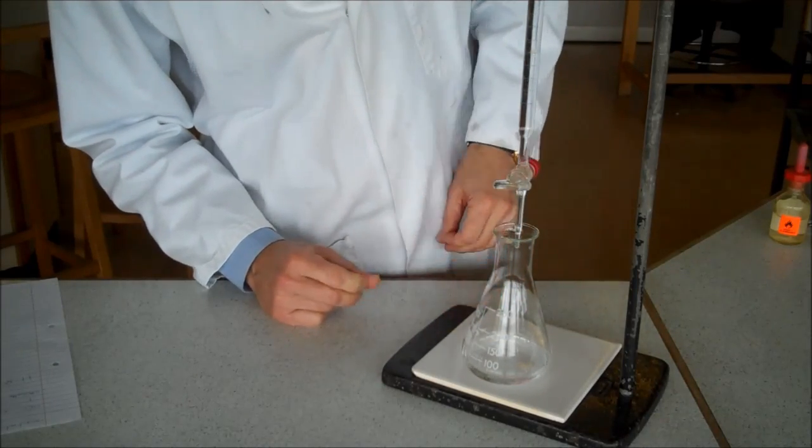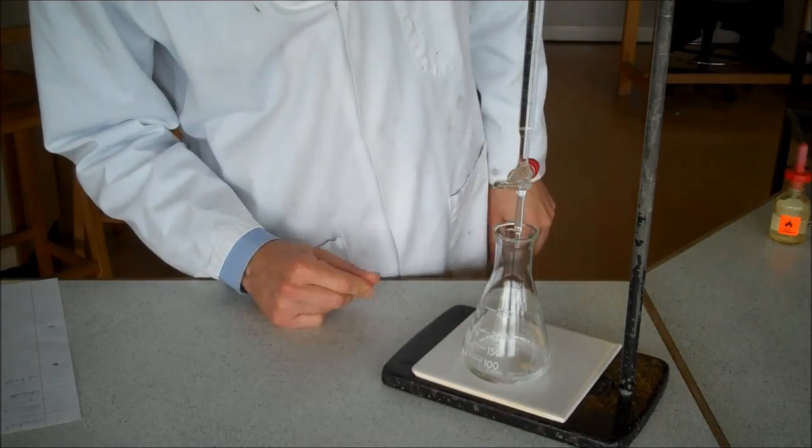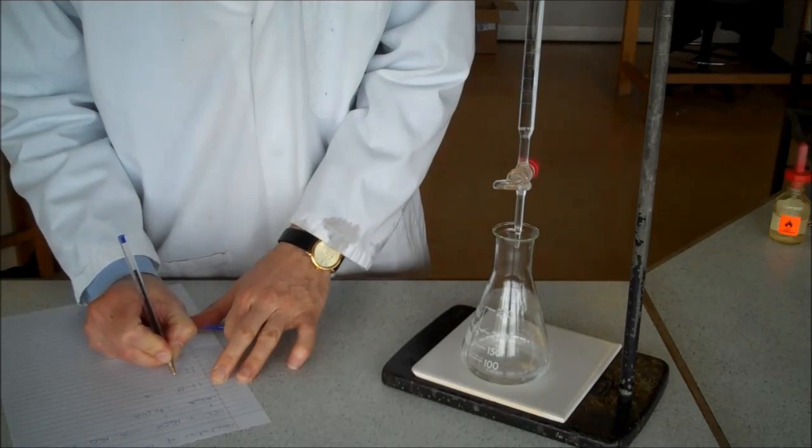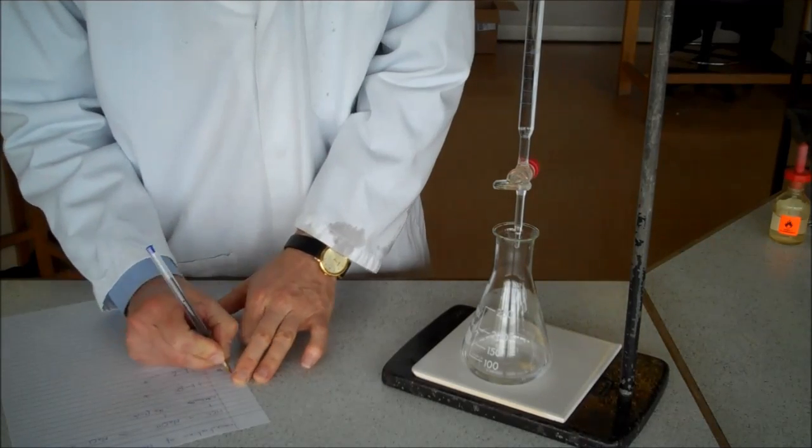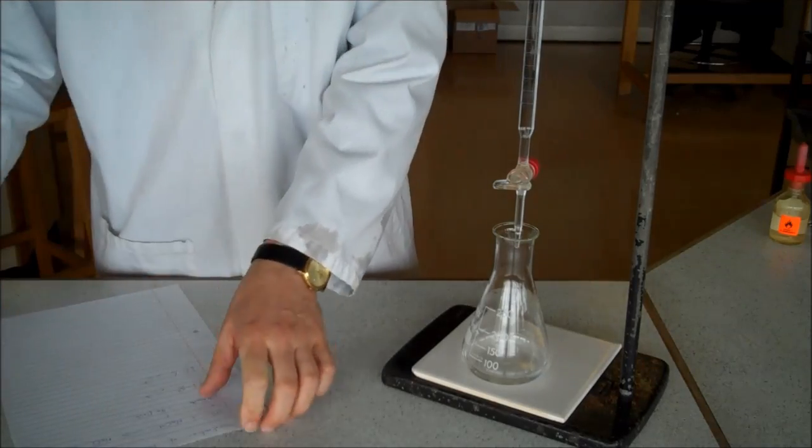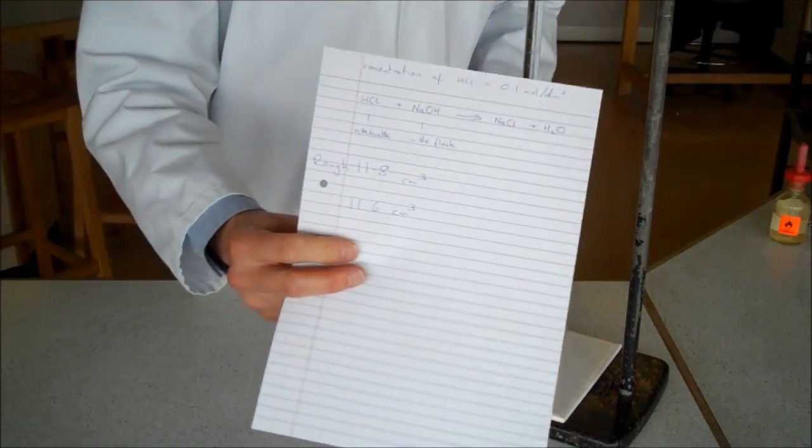So this time, I look at my result, I subtract it from my initial reading, and I find I've actually, this time, added 11.6 centimetres cubed. My rough result was 11.8. My first accurate was 11.6.